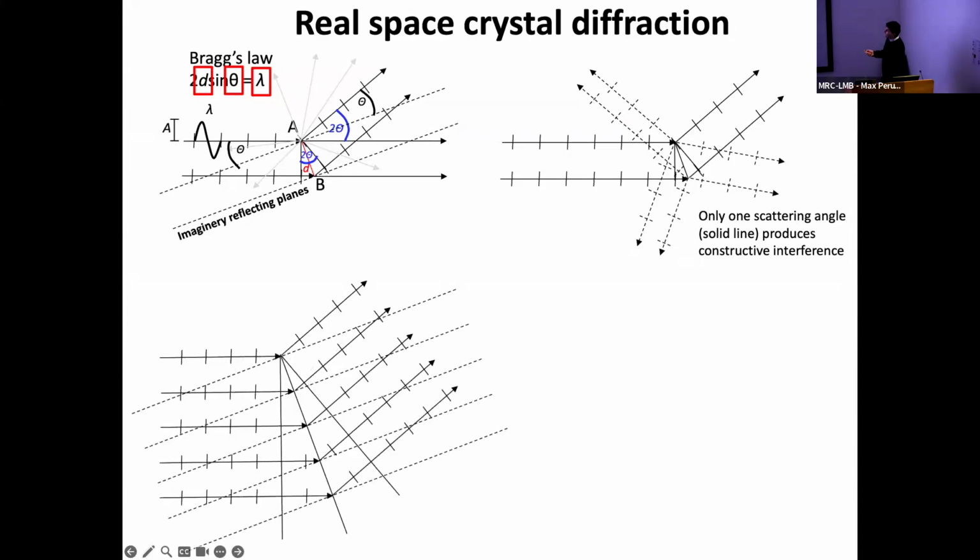And it turns out, to satisfy Bragg's law, if you have a fixed lambda, it happens that if this distance d decreases, gets smaller, this angle becomes bigger. So your mirror planes are kind of rotating this way, okay?